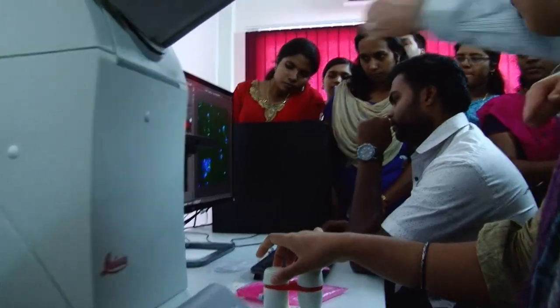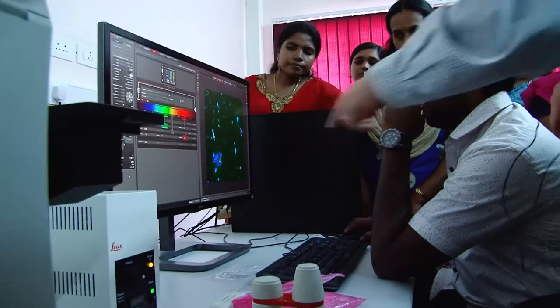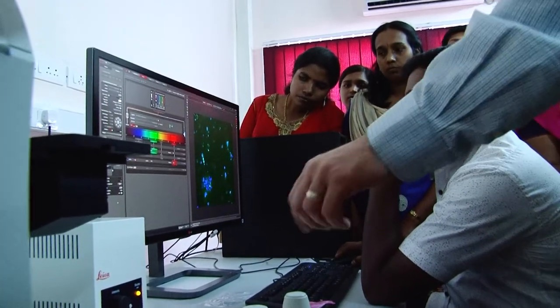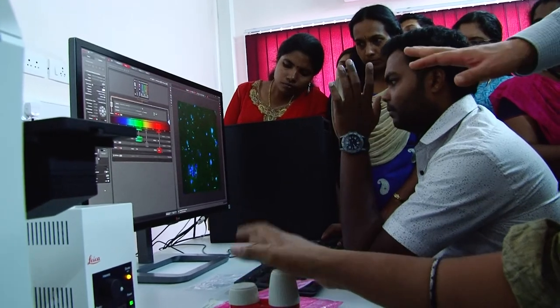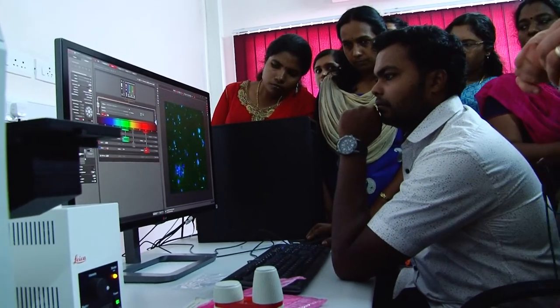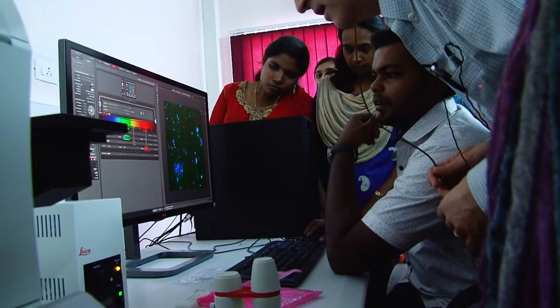Now see what I said about the speed. See how the speed, you can see the raster coming down? It's not the fastest thing in the world. Okay, so go down a little more. Keep going, keep going. Okay, perfect. Call that bottom. So does it tell us how many Z steps we have? No, you can increase it.